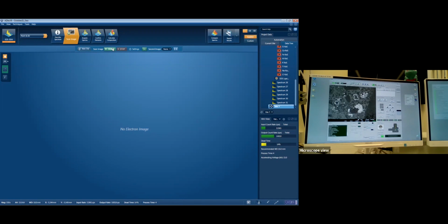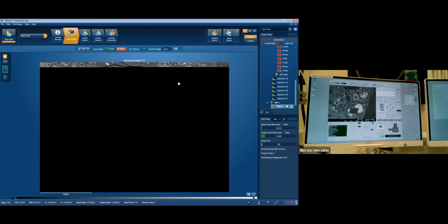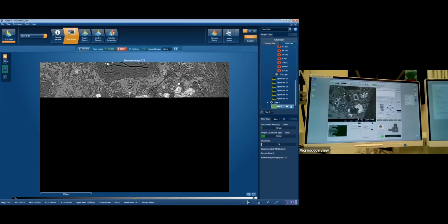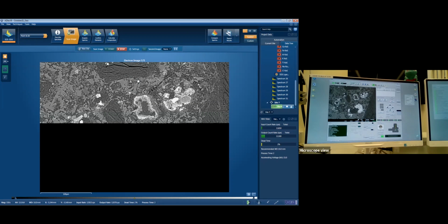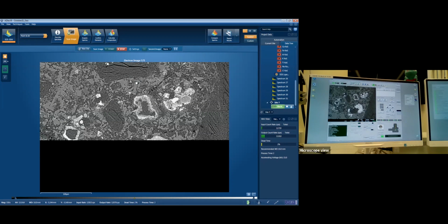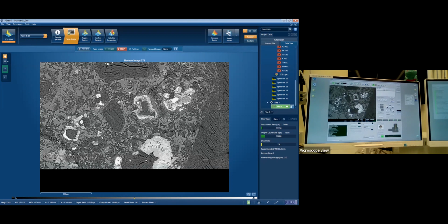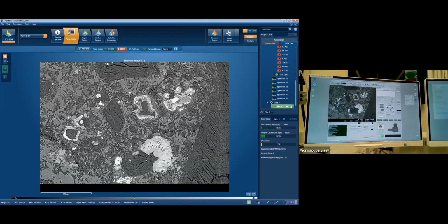Fluffy. Yeah. Very fluffy. We'll pull this one across. So I've just zoomed in a little bit. Again, you can see how all the stuff in the background is really, really fine grained. Lots of little crystals rather than one big crystal. Actually, could we zoom in again? Yeah, get some fun intergrowth patterns happening.